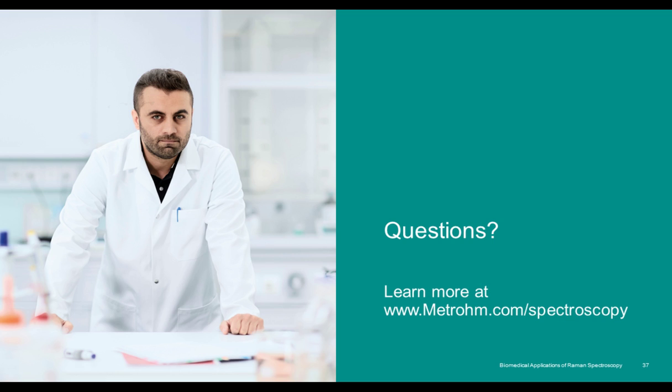Yeah, and if I can weigh in on that one, just because if I go back to my undergraduate days, I can remember doing a project on this. And we actually were able to successfully study the way some humic acids in some soil samples out of somewhere in the western United States were actually changing as they were complexing and exposed to different saline solutions via their Raman shifts.